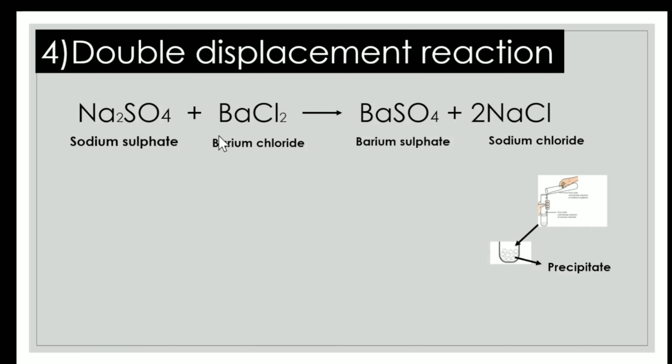Observe clearly, these both exchange their positions and form the products. This beautiful reaction is called a double displacement reaction. Observe clearly, sodium sulfate and barium chloride, right? Both solutions are mixed together. So what beautiful thing will happen? Sodium will replace barium's place, and barium will replace sodium's place. It is called a double displacement reaction.